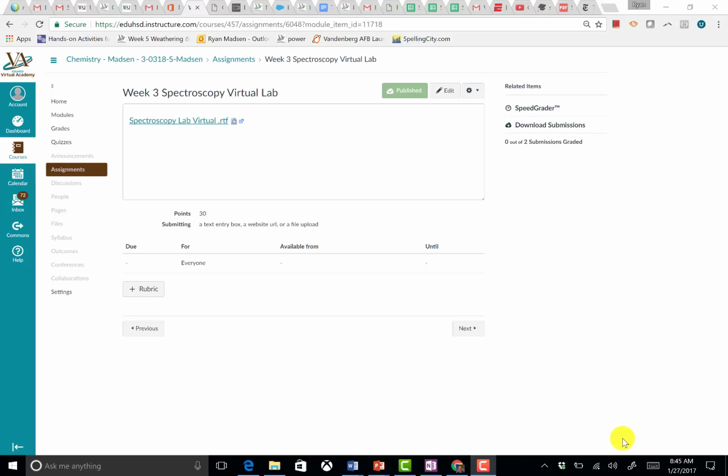So let me show you how to do it. There's a few parts of it that are a little quirky when it comes to the interface. So just want to take about 5 minutes to show you this.